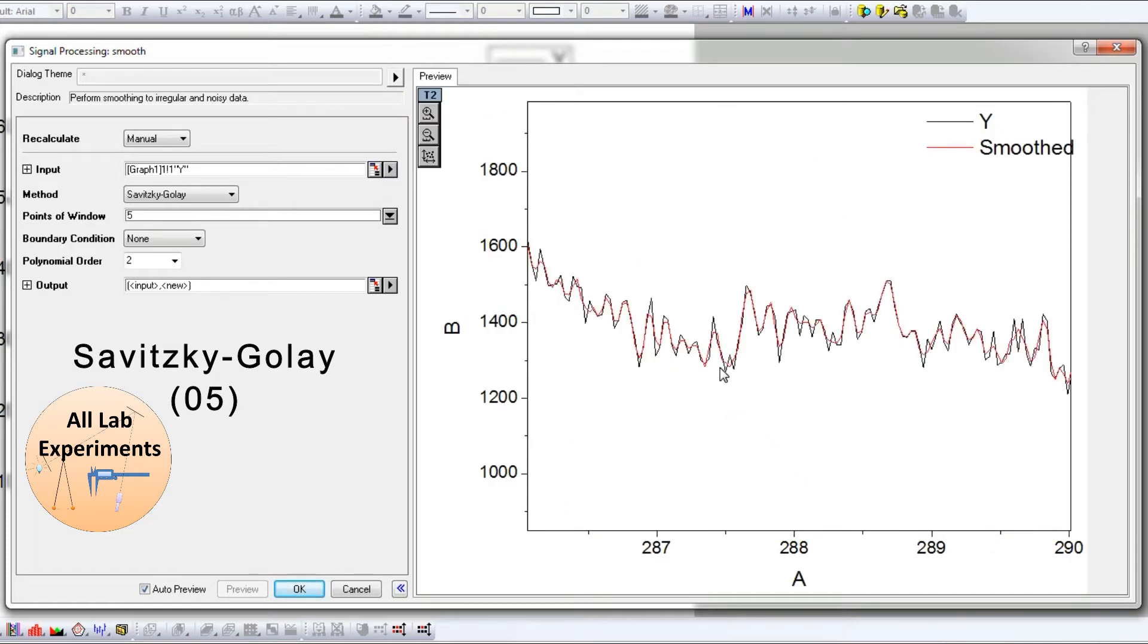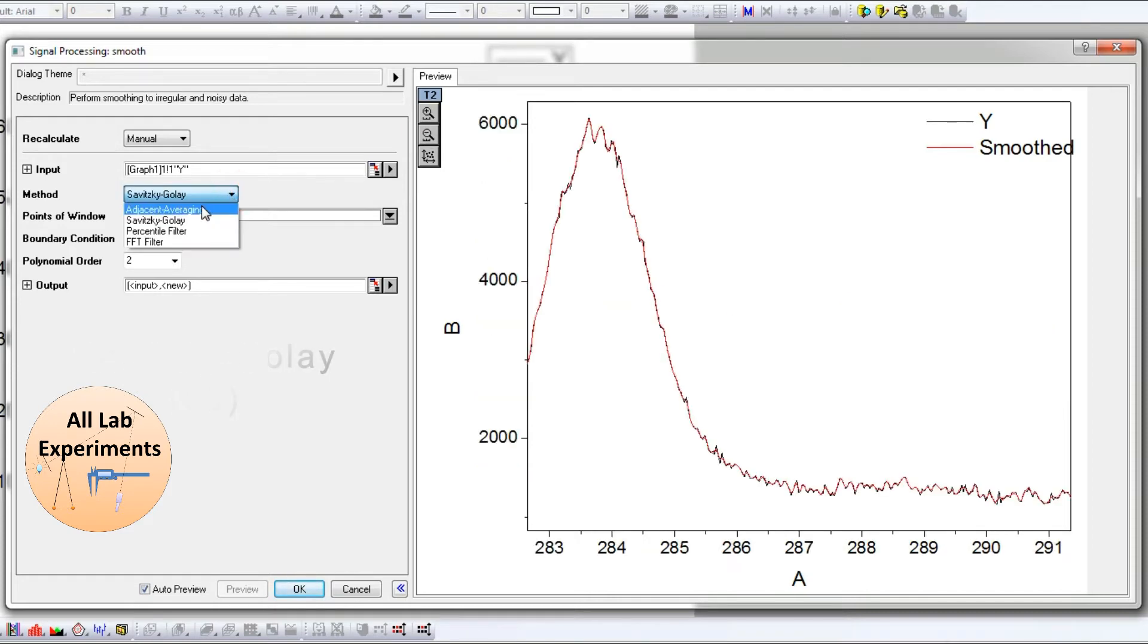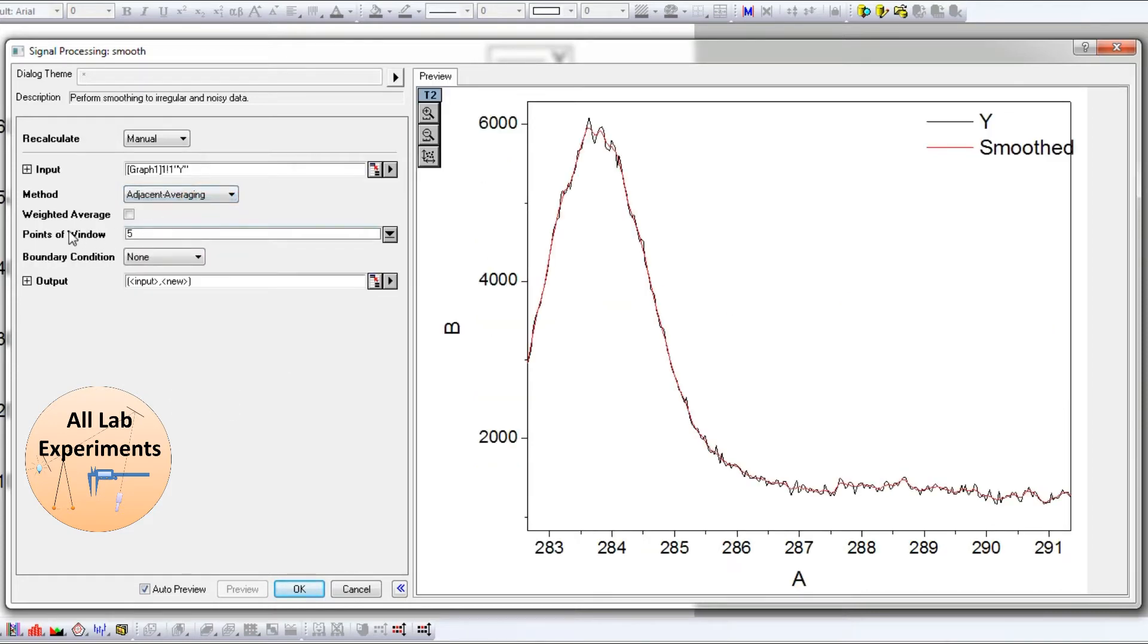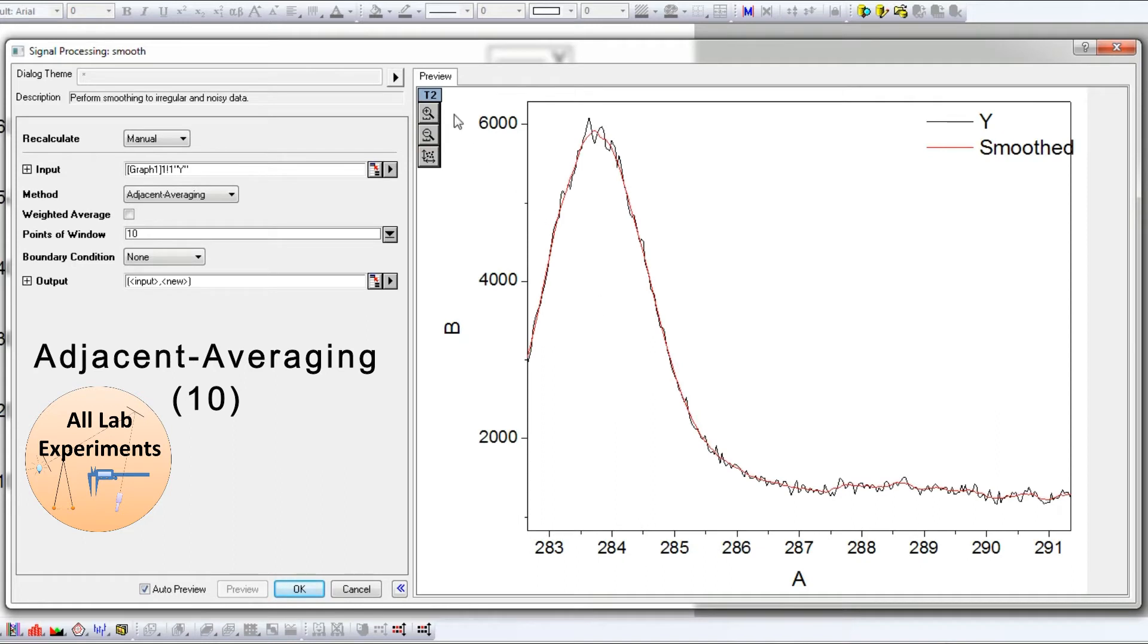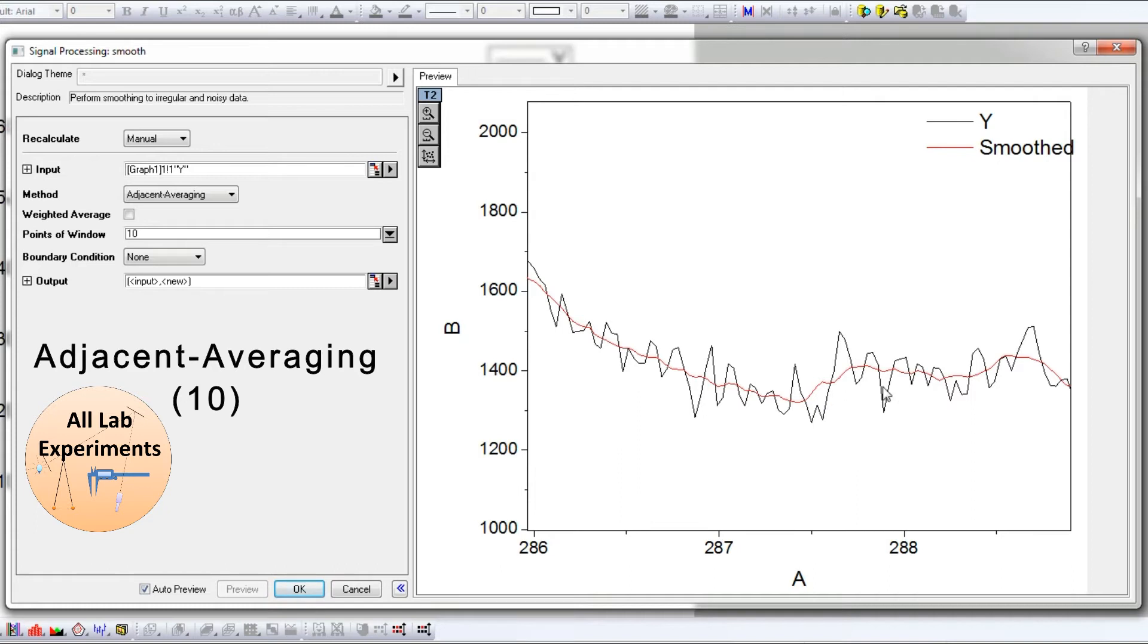Now I am increasing the number of points from five to ten. If I increase this number of points to ten, we will see that in Adjacent Averaging the smoothness has increased.